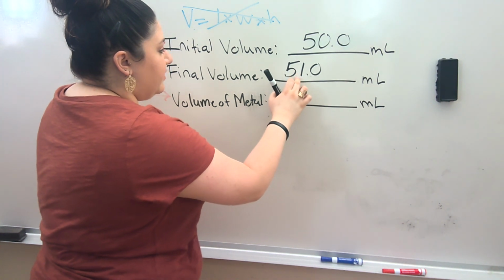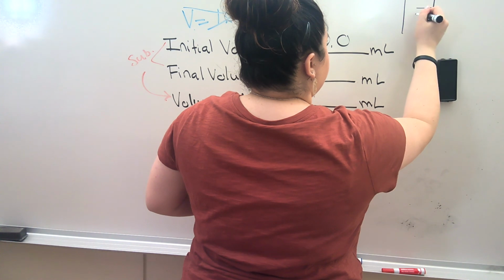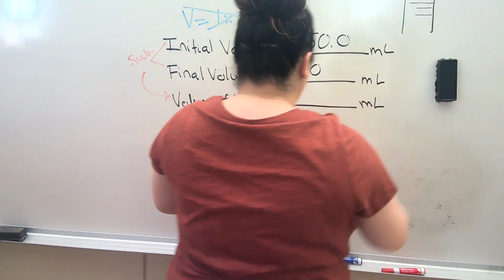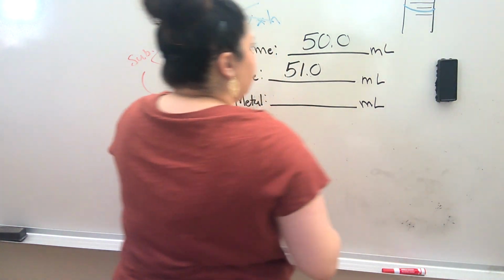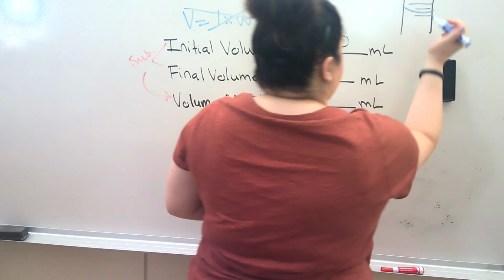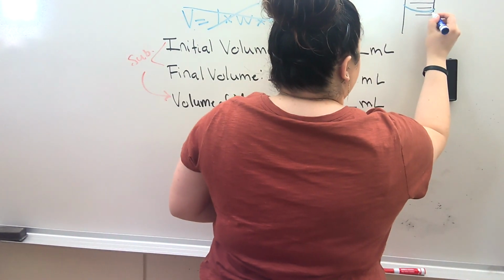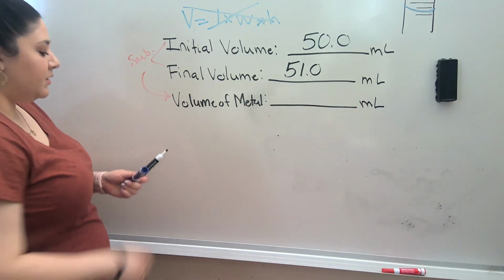Now, if I draw this over here, if these are your two little lines and your meniscus was in between those two lines, then that's where you and your partner would guess, and I would imagine 10 little lines, or 9 little lines, in between to help you determine that, okay?